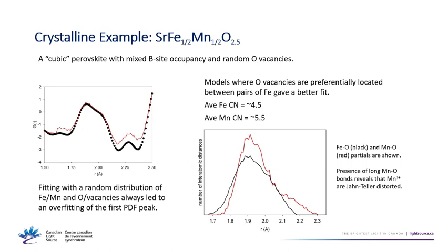Oh yeah, I think that was not TEM PDF, but more like the single crystal diffuse scattering that you get from the TEM image.